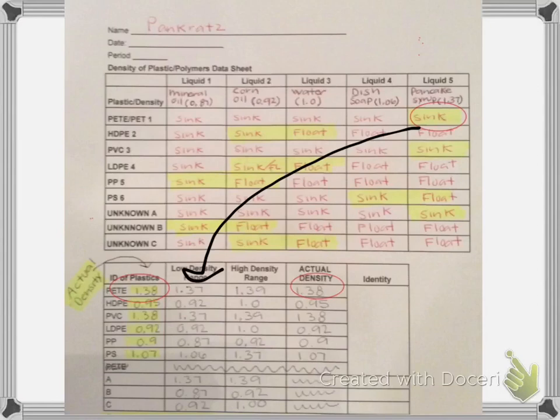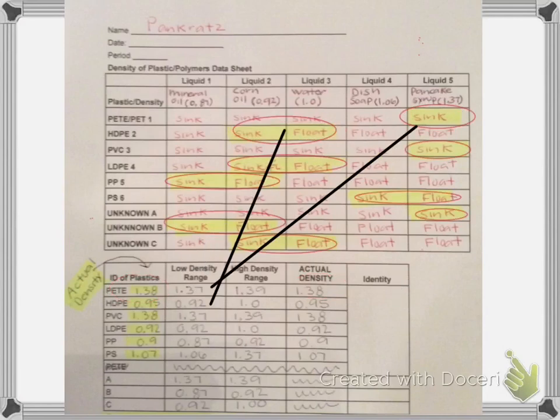Let's go ahead and look at HDPE. So for HDPE, I have a sink float right here. So my low end is going to be the sink. And so I'm going to put 0.92 for my corn oil. I'm going to transfer that down here. And I'm going to transfer the water, which is the 1.0 from my float, into the high density range.